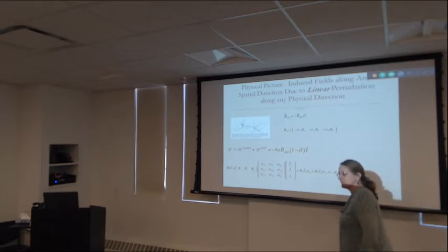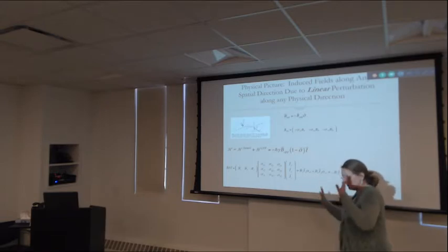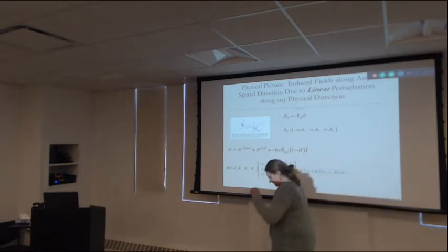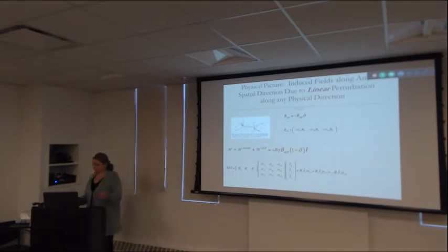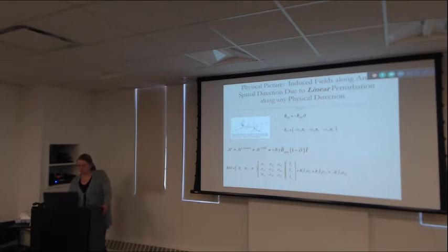Those are 9 independent experiments. No 2 of those experiments or questions have to be the same as each other. It's 9 different questions. The field this way, this way, this way, measure this way, this way, this way. In the most arbitrary situation of a very low symmetry molecule, it could be that they're all different.